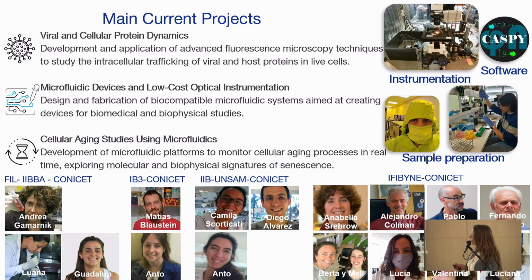And in order to address these questions, we develop specific instrumentation. This is how our homemade instruments look. It's very different compared to a commercial microscope. This is a 2-photon orbital tracking microscope. This is not working, but okay. And we also develop our own software to acquire and analyze data.